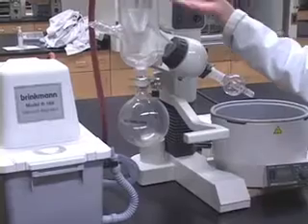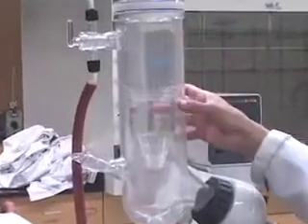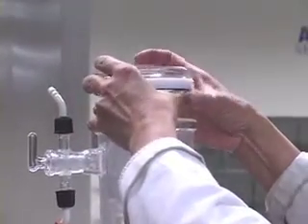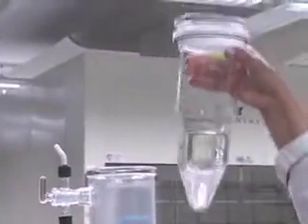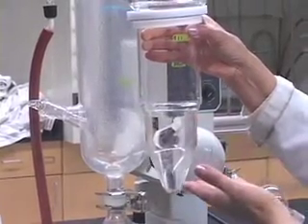How do we cool the condenser? You notice that there is liquid inside the cold finger, if you want to call it that. Let me just show you that portion. Here is the cover. Here is the actual condenser portion, which already has some liquid in it.